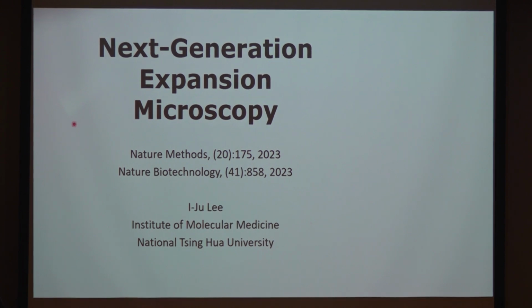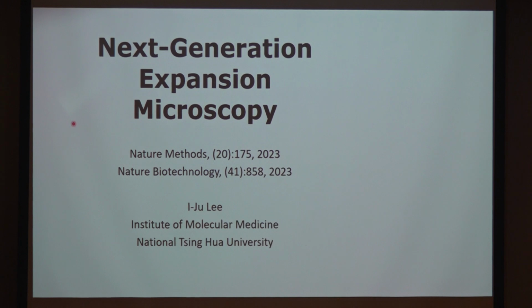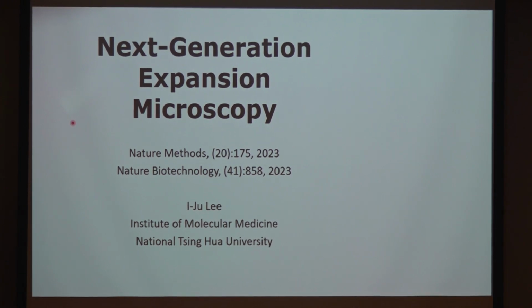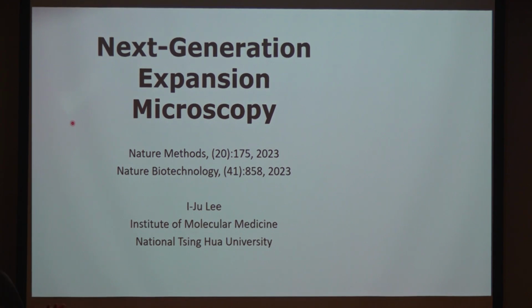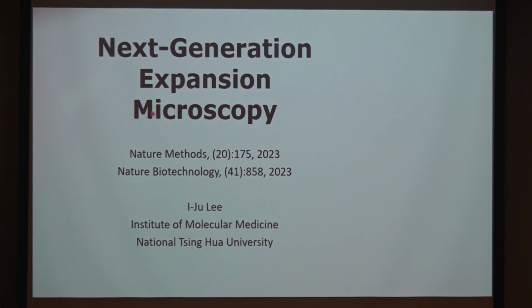Today we'll be talking about a different method, which is expansion microscopy. How many of you have heard about this method? No? Oh, somebody did. Okay, so we're not only going to be talking about expansion microscopy, but we'll talk about the newest development of this methodology.